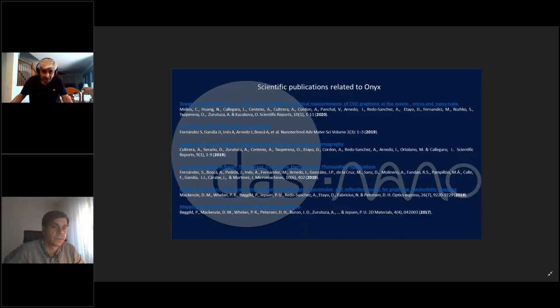What is the frequency range available? The frequency range in the terahertz range is up to 5 terahertz, so from 0.1 terahertz up to 5 terahertz. This is where we have enough signal to noise ratio to characterize the samples.